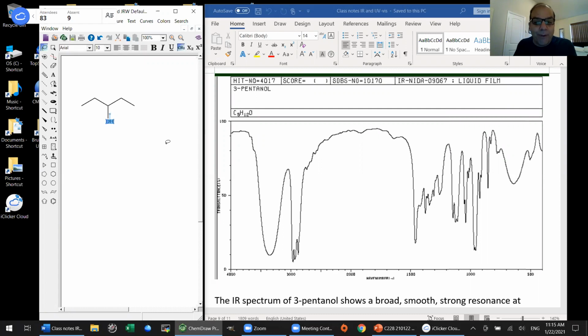And where are we going to put that? What do you want to call that? 3350, maybe 3400, very typical place for those to show up. And that's the first one we've seen of this type. And boy, it just jumps right out at you, doesn't it? So nothing else looks like that. Nearly all alcohols will have that type of smooth, symmetrical, pretty, and broad peak like that.